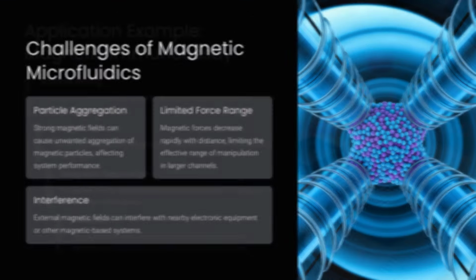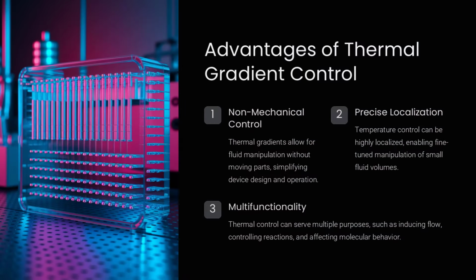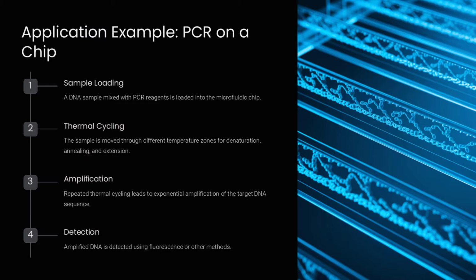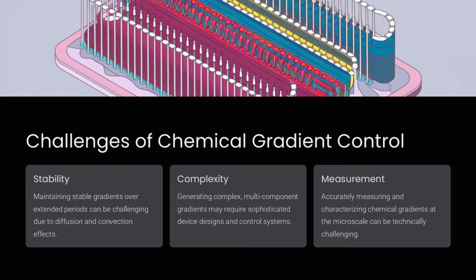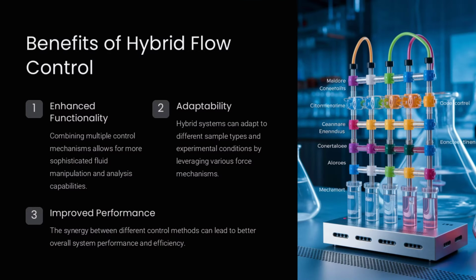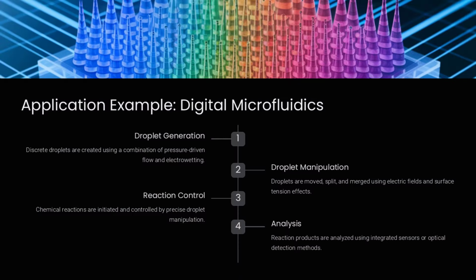Capillary action enables passive movement, particularly in paper-based microfluidics, where small channels wick liquids without external power. Think of how a tissue absorbs water. Acoustic waves can generate pressure gradients to manipulate droplets and cells with great precision, useful in biological sorting applications. Magnetic fields are employed to steer magnetic nanoparticles, enabling controlled drug delivery or biochemical reactions.